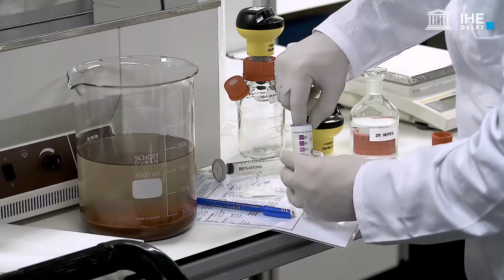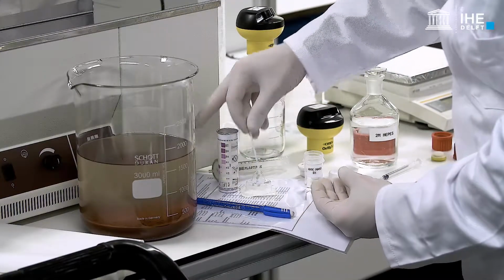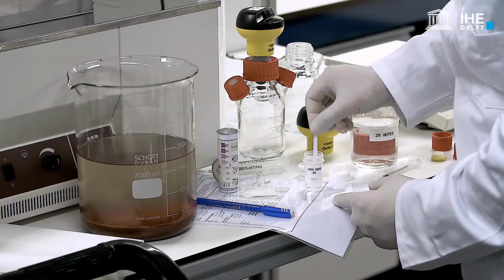Use fast nitrate estimation methods, like paper detection strips, to quickly assess the presence of nitrate and nitrite.